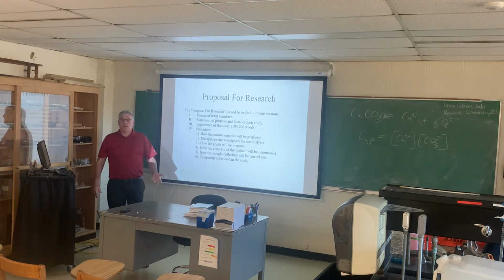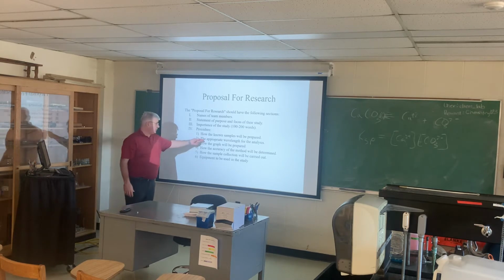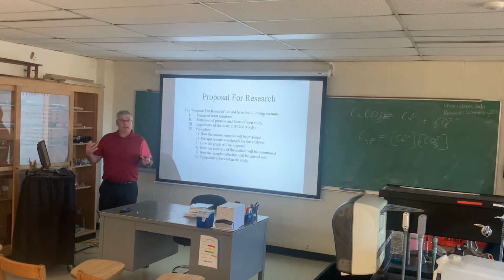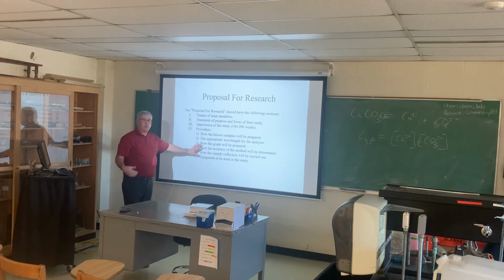Accuracy. Well, in accuracy, one of the things in science is that we compare it to something that we know. So to make our calibration curve, we're going to prepare standards and then compare the absorbance of our unknown to standards. And then we can do repetition to make sure that we're getting good runs and so on. And so anyway, I want you to discuss that in that way. And then how you're going to do the sample collection, details, all right?